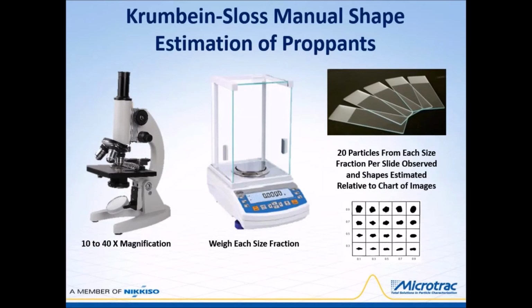The procedure for estimating sphericity and roundness of proppants by using the Krumbein-Sloss chart uses a 10 to 40x magnification microscope and a balance with an accuracy to 1 milligram. The technician records the weight of each fraction, then chooses 20 particles at random and observes them microscopically and estimates their shapes relative to the images labeled with values on the chart and reports those shapes to the nearest 1/10.